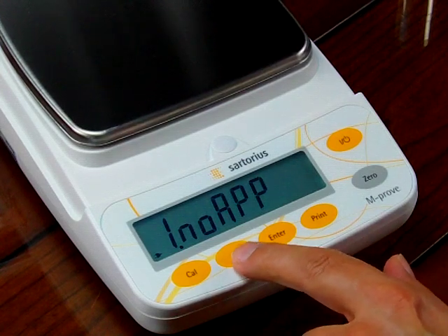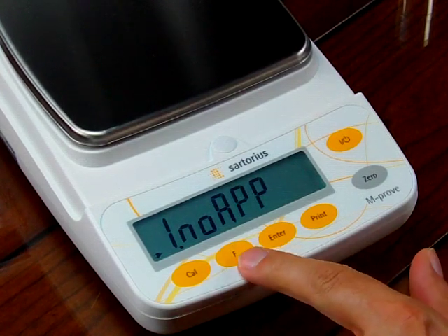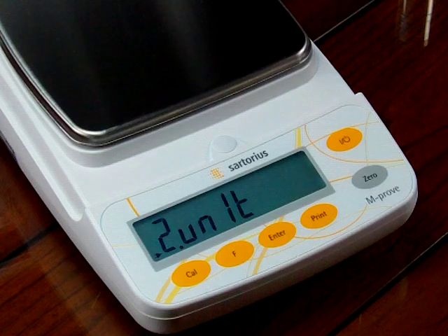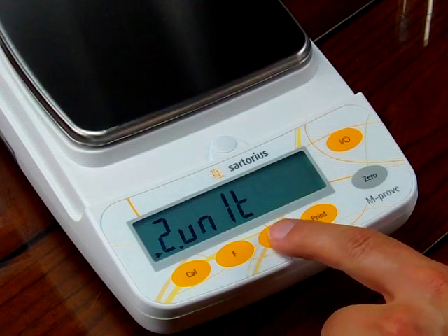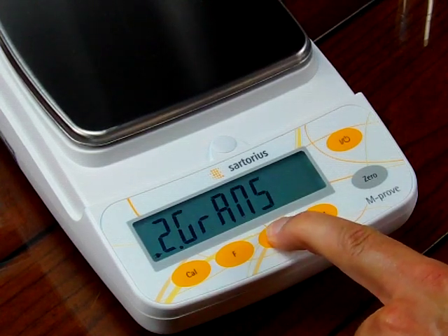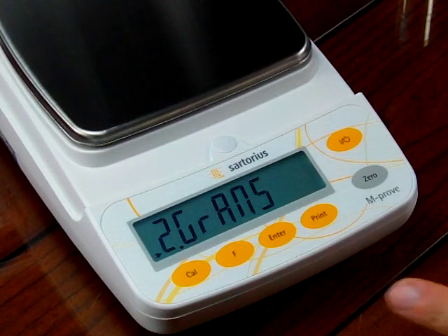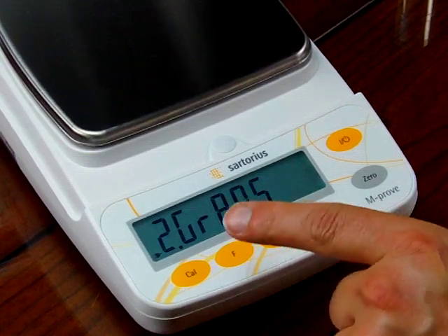So we want to go to weigh units because we want to be able to toggle between two weigh units. We press the F key until we see two — unit — and then we press the enter key to enter the unit application.